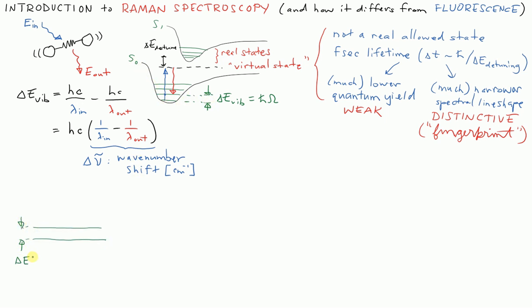And one thing that's interesting about Raman spectroscopy compared to fluorescence is that, let's suppose I come in with a laser that I might have tried to excite fluorescence with. So I start off in the ground state down here, and I excite the molecule up, and then it emits an outgoing photon, just like we have here. It scatters a photon off. You can either think of it, by the way, as a new photon or as the scattered incident photon, but with less energy on an inelastic collision. But this is a situation that looks a lot like fluorescence. You have an energetic photon coming in, you have a less energetic photon that comes to your detector.